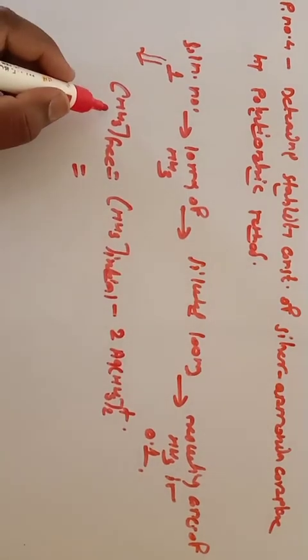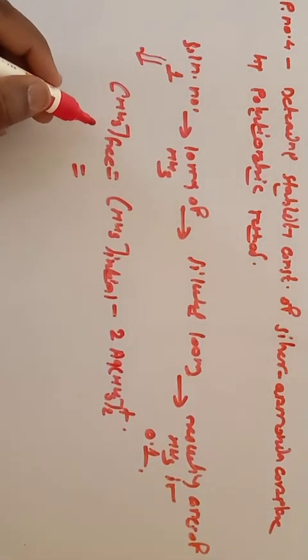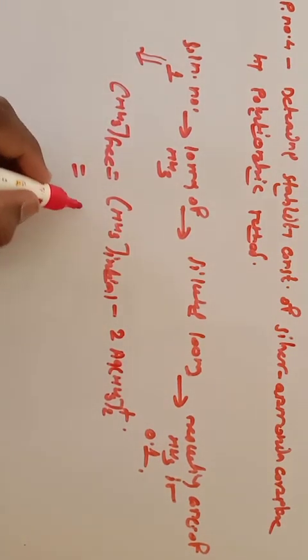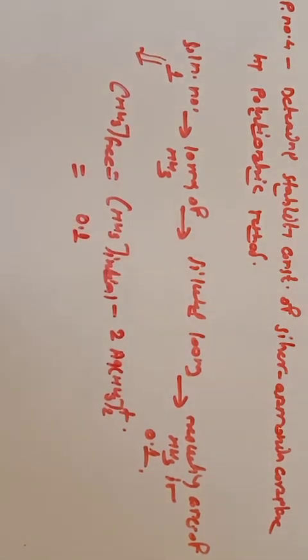This term is given in the observation table, but how one can obtain this value? The concentration of ammonia initial is 0.1, since initially 1 normal ammonia is used for dilution.